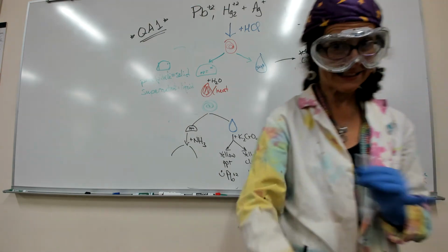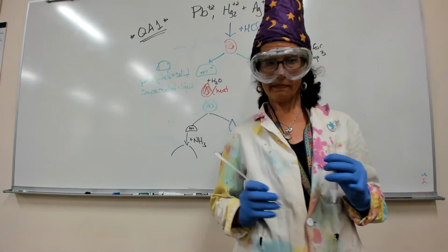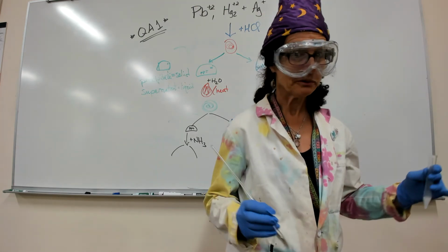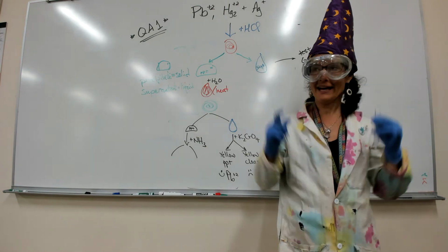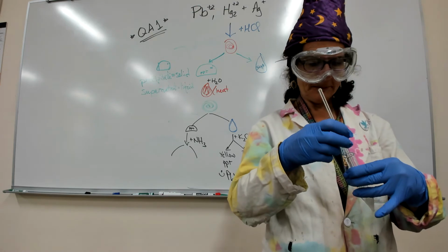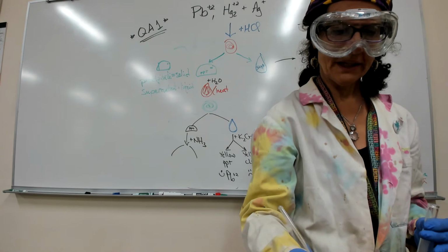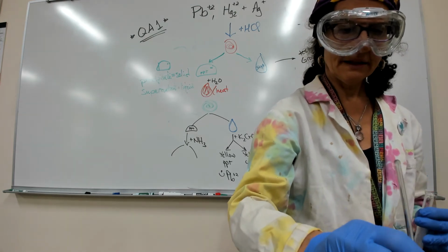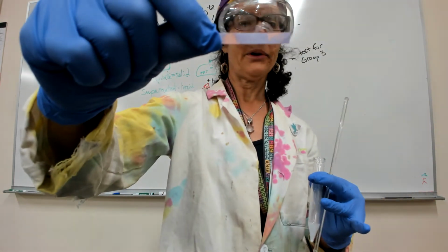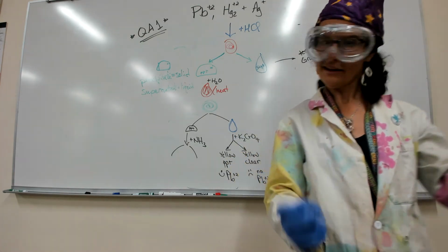And the way we test to see if it's become acidic, we can see it precipitated again. But we can show that it's acidic because when we touch the litmus paper, this was blue litmus paper, and it turns pink, which means it's an acid. And there we go.